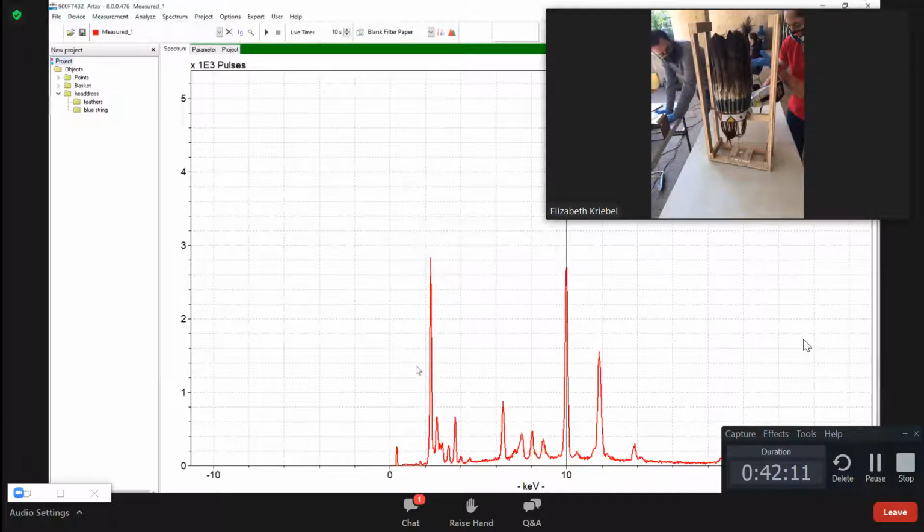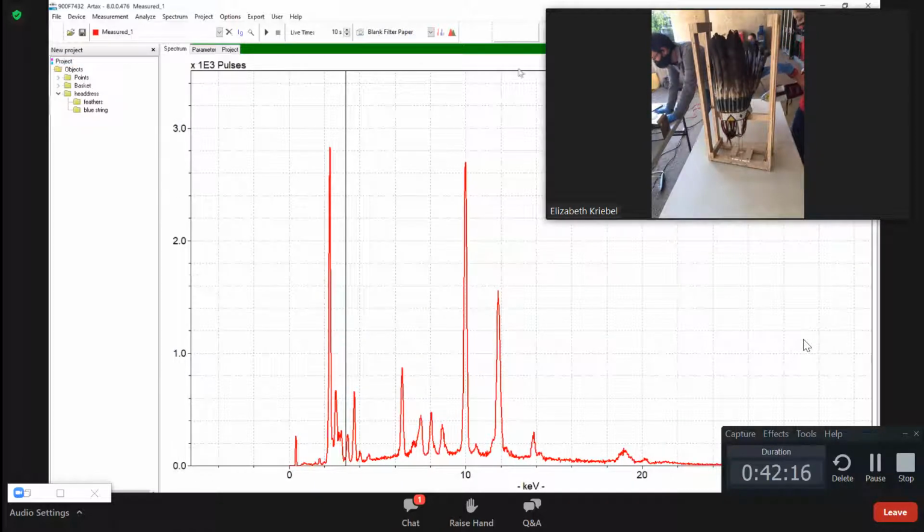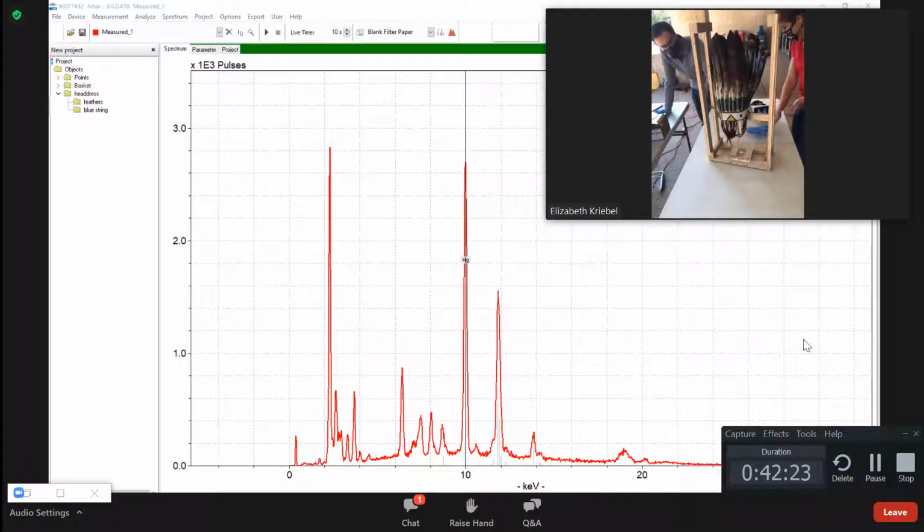Oh, all right. So our battery died, but I did get a quick spectrum, and that is vermilion. So maybe it's contamination from the red. Well, that doesn't make any sense to me. How do you get all the way up there? And that was not the red part of the felt, that was the gray felt. Yeah, the gray felt is packed with mercury. So that's not pigmental either. Absolutely packed with mercury. So the feathers are fine. Everything else is terrible.